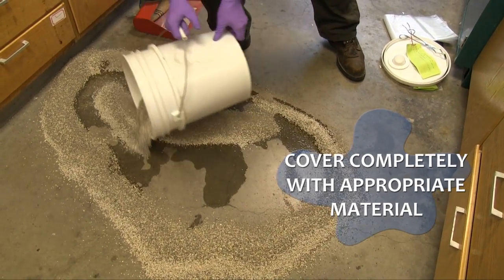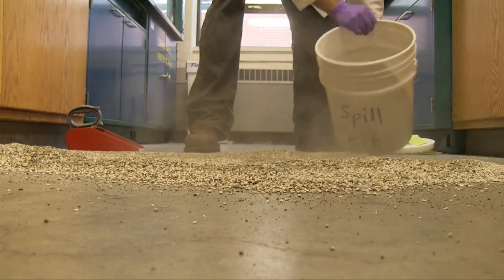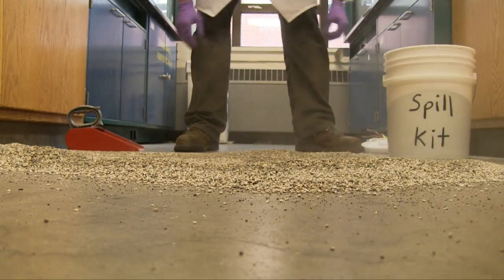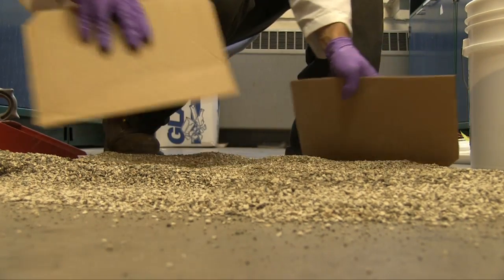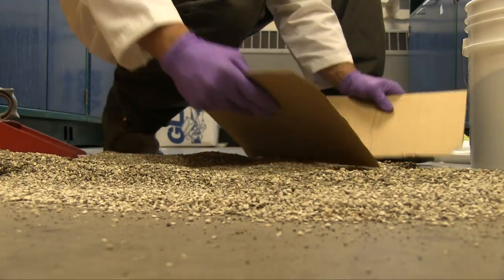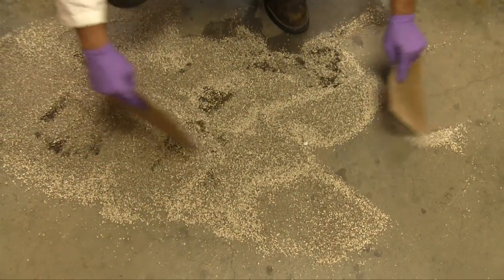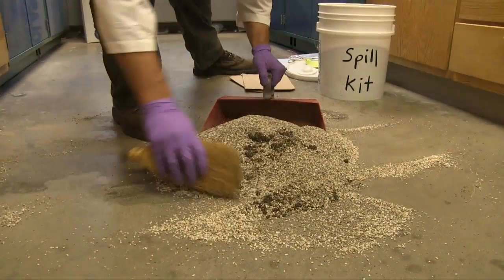Slowly work from the outside in, placing floor dry onto the spilled material. Wait a few minutes, allowing the spilled chemicals to absorb. Slowly mix the floor dry and sweep up the material.